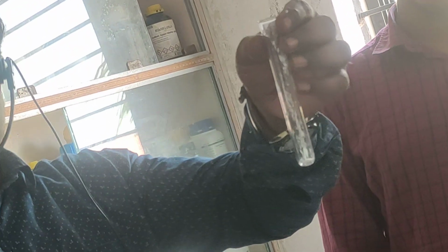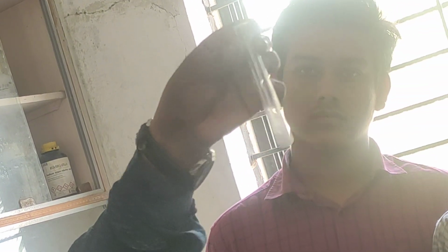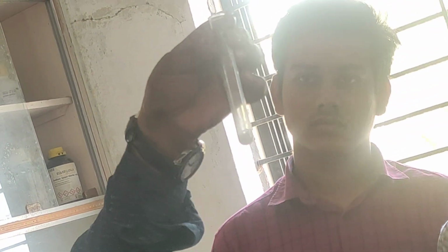Okay? For this you have to add dilute HCl, not water. It is the original solution we are preparing, so slowly add dilute HCl. First you add just a little bit, then gently shake the test tube.